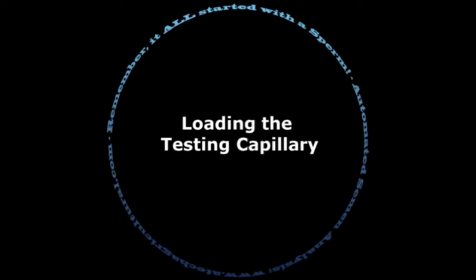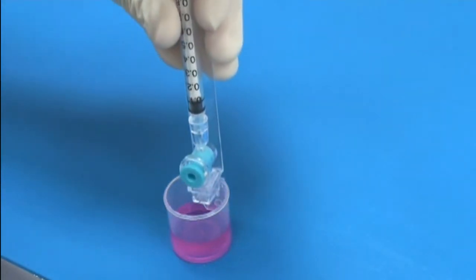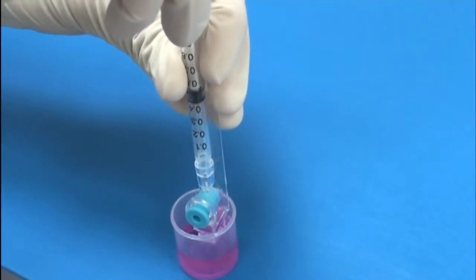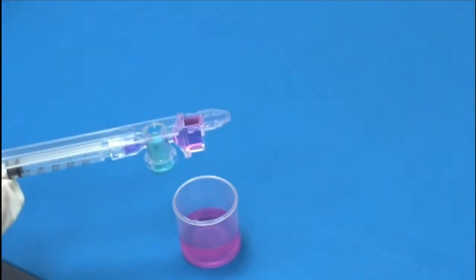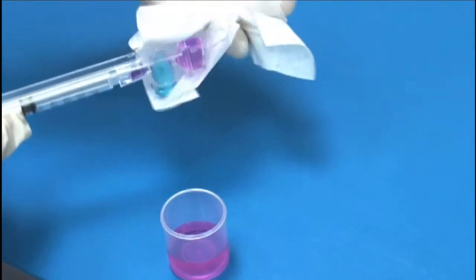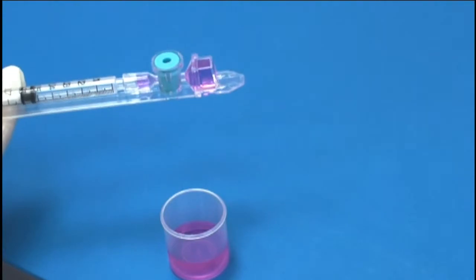Loading the testing capillary is the most important part of running a semen sample. Follow these directions. Insert the capillary into the sample. Slowly pull back on the plunger to fill the testing chamber. The chambers are filled when the sample is seen just past the blue stopper. Using a Kim wipe, wipe away excess sample from the capillary tip using a gentle pinching motion. Press in the blue stopper and check closely for bubbles in both the large chamber and the tip of the testing capillary.